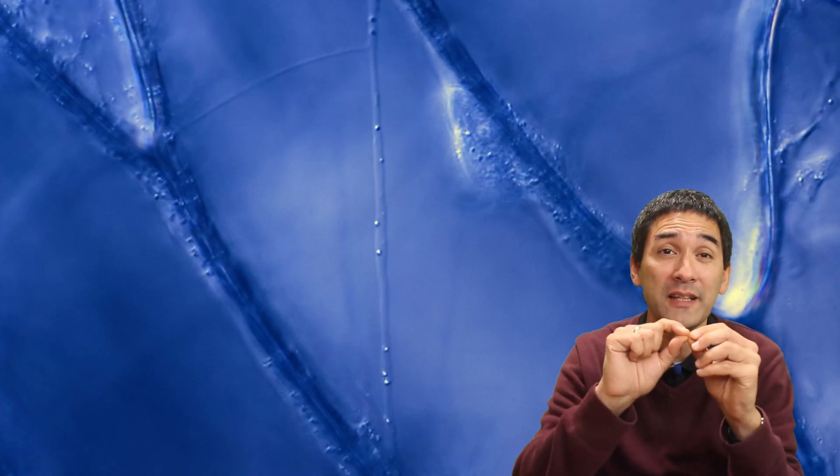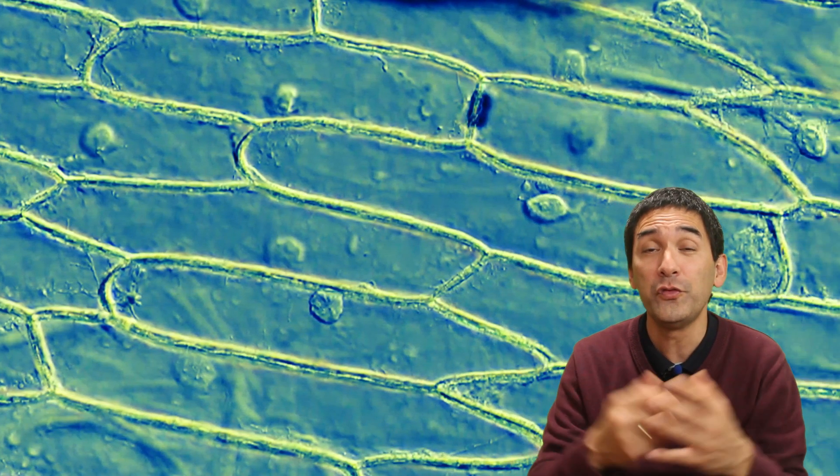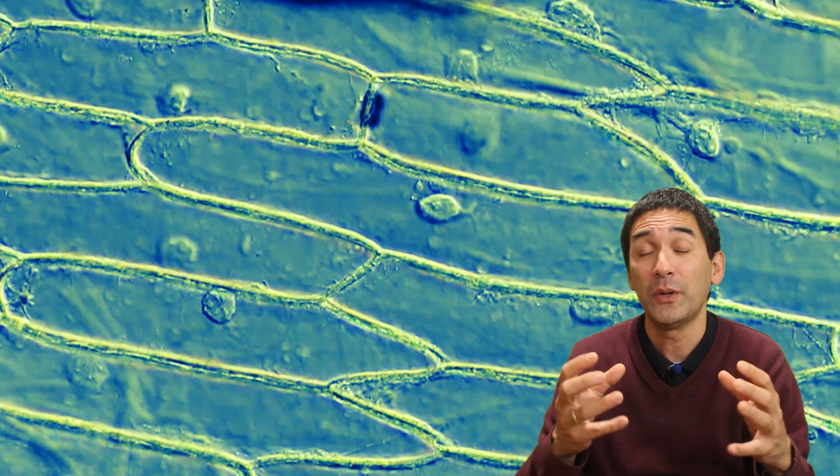This is where we see those tiny little vesicles, these dots, moving along inside the cell, almost like on a highway. There are other regions in the cell where those vesicles are not there. The movement is not well visible when you just have an overview image, but when you zoom in and magnify it quite a bit bigger, those vesicles start to become apparent.